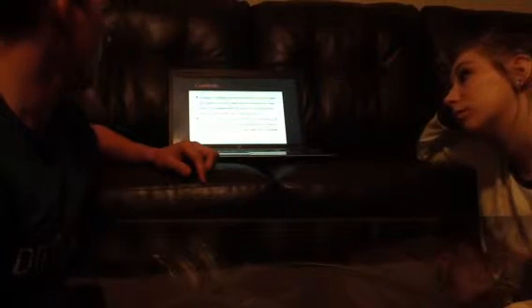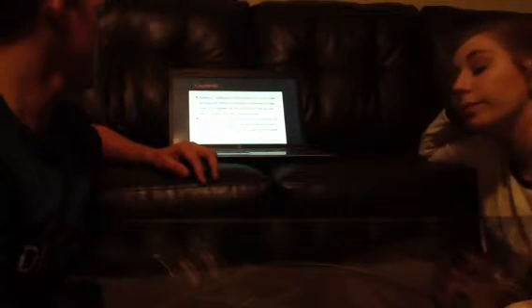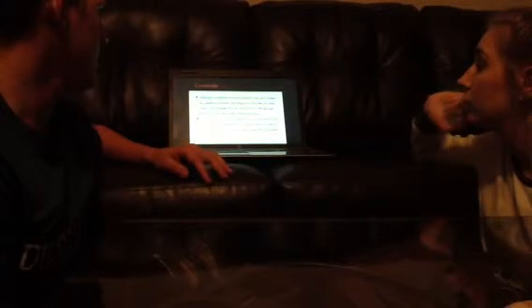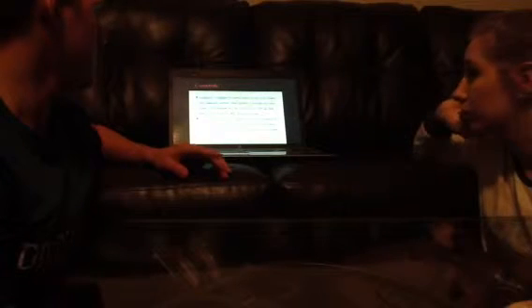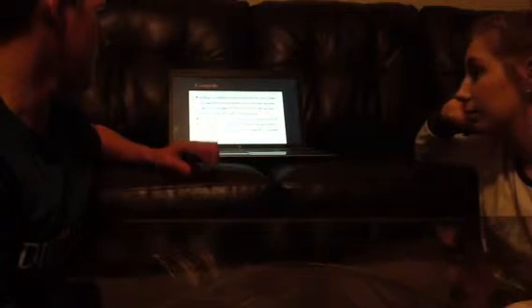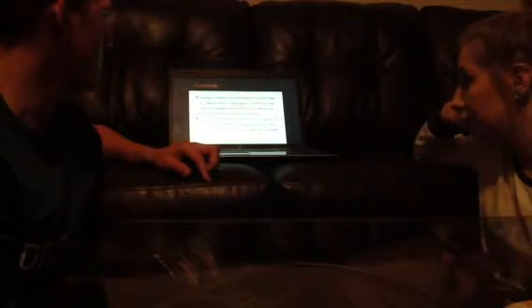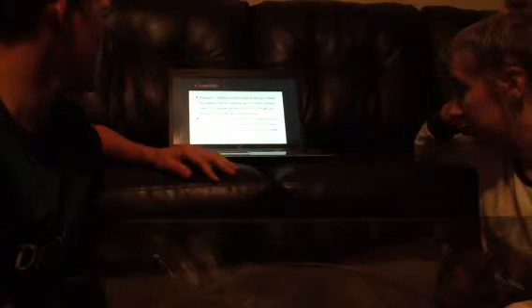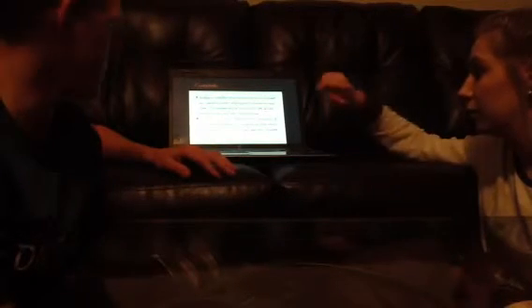Controls. To create our controls, first we need to add 0.1 milliliters of sterile water to 2 petri dishes to make our negative control. We'll then label each of the containers as made ready. After that, we need to make sure that the spreader is cleaned with 70% alcohol and fire before, after, and in between each use. For our positive control, we need to take 0.1 milliliters of our premixed 1 to 50 E. coli solution and also add it to 2 additional petri dishes per labeled test tube. Again, we need to label the containers to keep them separate.